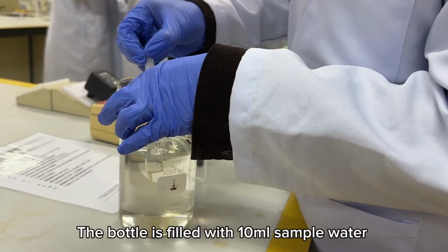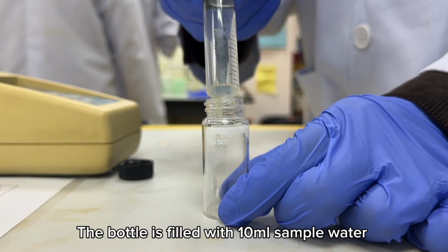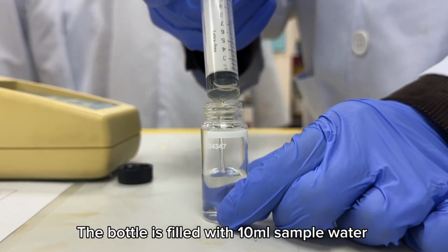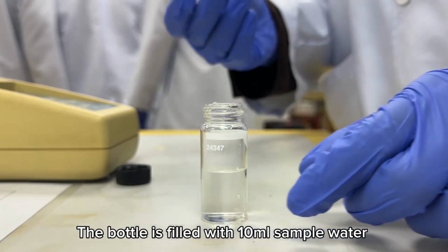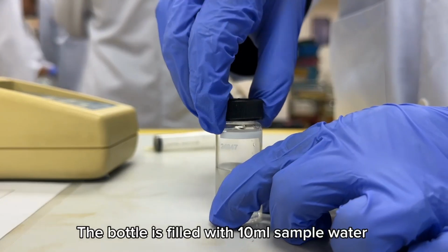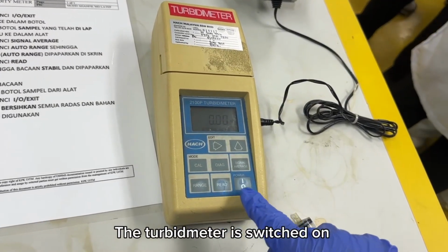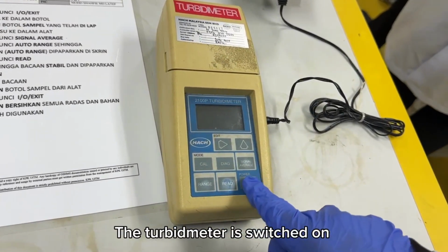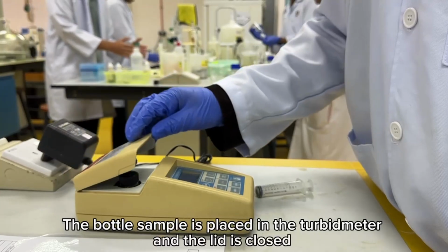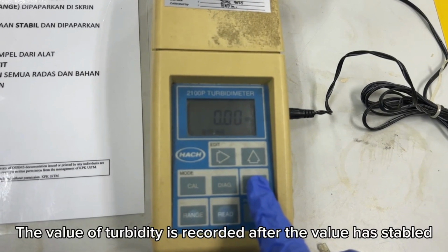The bottle is filled with 10 milliliters of sample water. The turbidity meter is switched on. The sample bottle is placed in the turbidity meter and the lid is closed. The value of turbidity is recorded after the value has stabilized.